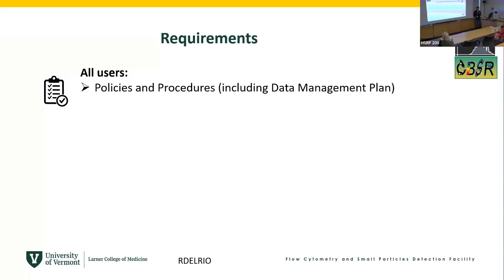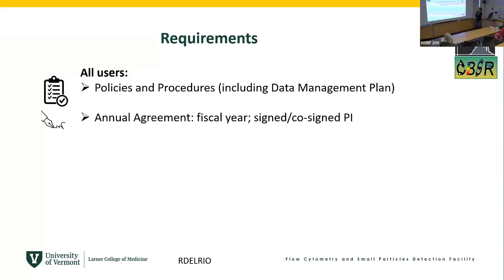All users will be updated from time to time when we have updates of the policies and procedures. In addition, you as a new user will need to sign an agreement. This agreement, regardless of the time that you sign, will be renewed every fiscal year. It needs to be signed by you as a user, and co-signed by your PI.